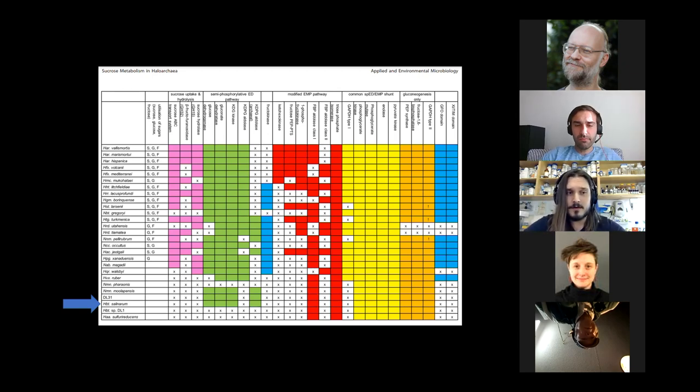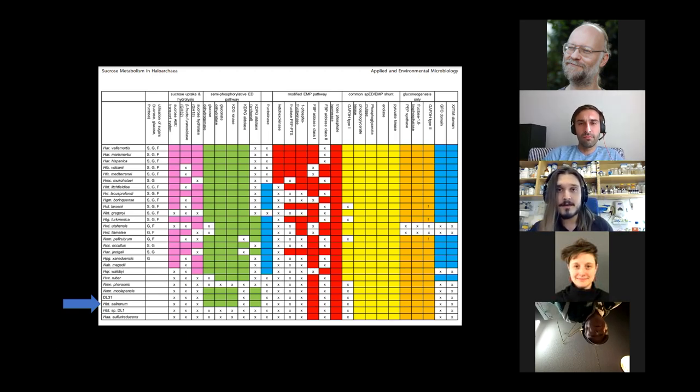So this is going to be a really long and slightly difficult project, but we're really hoping that once this is up, we shift our entire work to Halobacteria in general and just forget about E. coli entirely. Because if we can do DNA preps in 15 seconds using spin down and water, the amount of savings of plastic, reagents, time is innumerable.